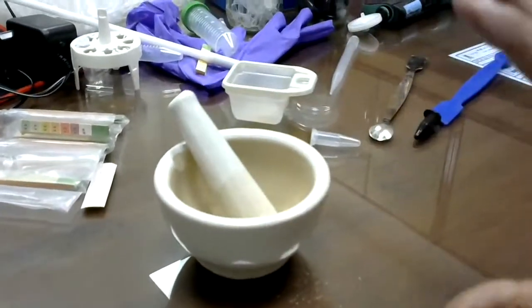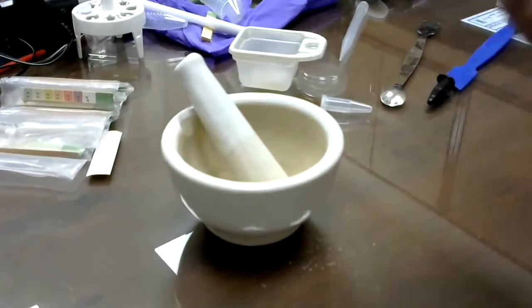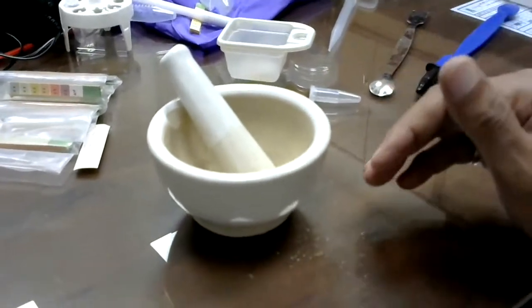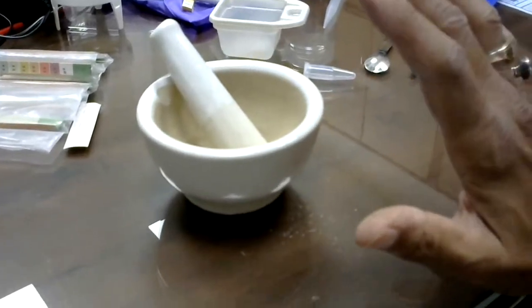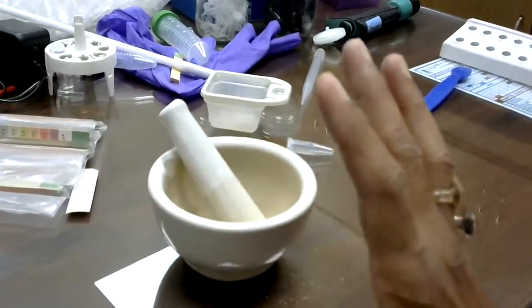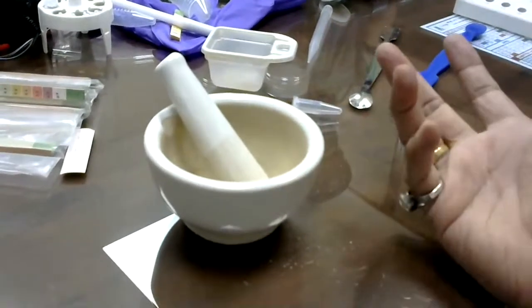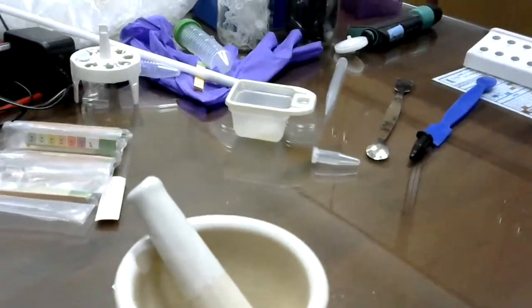You can wrap it with aluminum foil and autoclave it, or if autoclaving is not required, you can just clean it, but cleaning is very much required if you don't want sterilized material. So depending on the requirement, you either clean it, or autoclave it without wrapping or with wrapping.